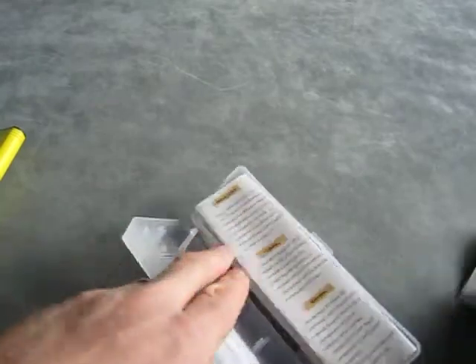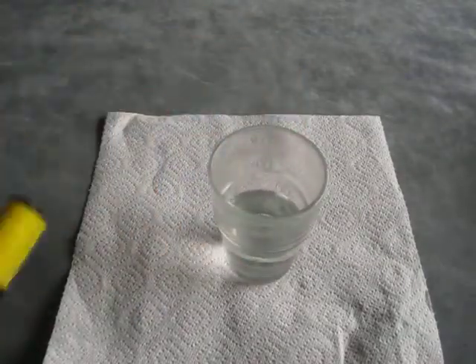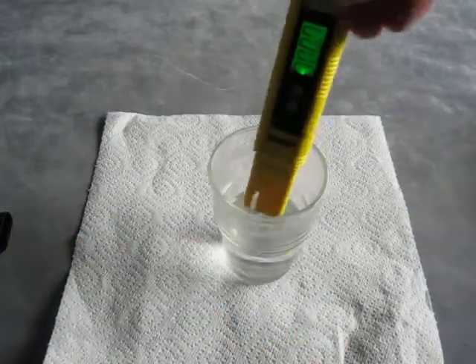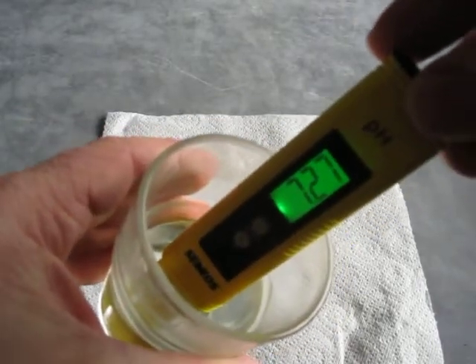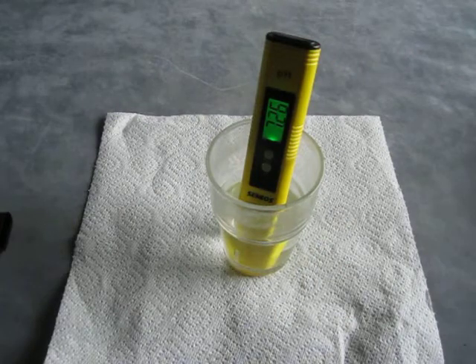Just to show you how quick this is — I wanted to show it actually in operation. What I've got here is a glass of water. So we take the probe, power it on, put that in the water, and you can see we're getting a reading of 7.27 for water.